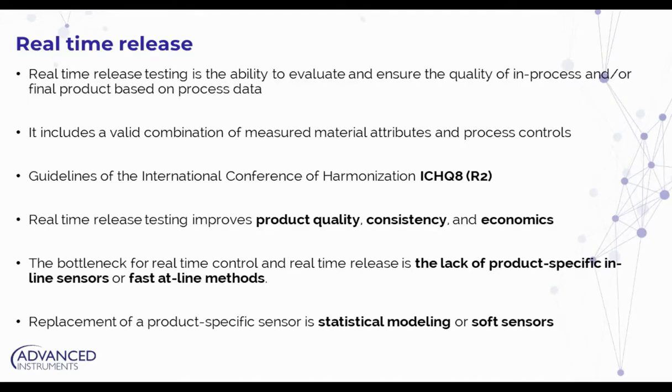Thank you, Kristeena, for this introduction to osmolality and for explaining the difference between osmolarity and osmolality. Actually, there is quite a big confusion in the scientific community about these terms, or maybe for a lot of people, osmolality is a new term and they have not heard it before. The work we have done in this context is done within a bigger frame. We are interested in real-time release.